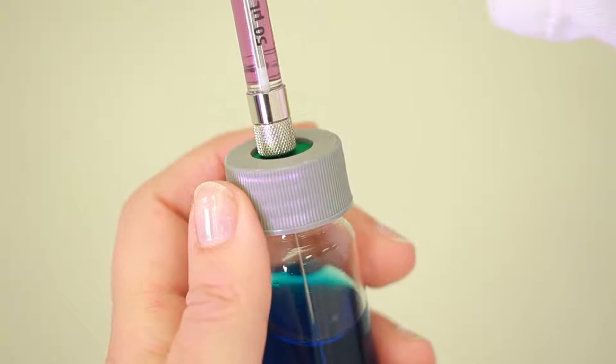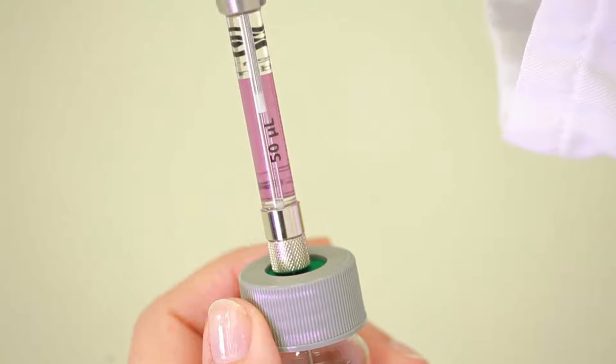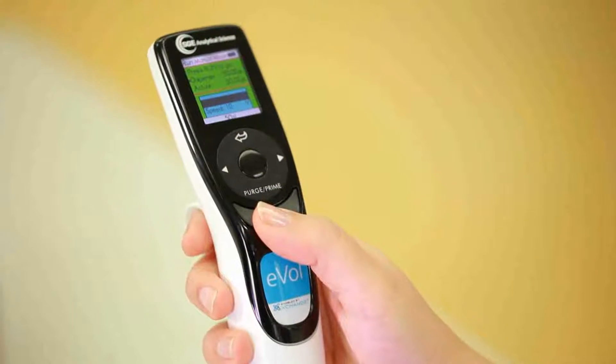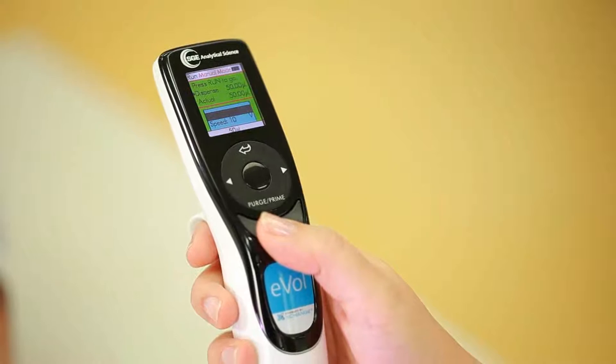EVOL allows you to aspirate and dispense liquids quickly and accurately, even in and out of sealed vials, providing more flexibility than ever before to simplify a workflow.